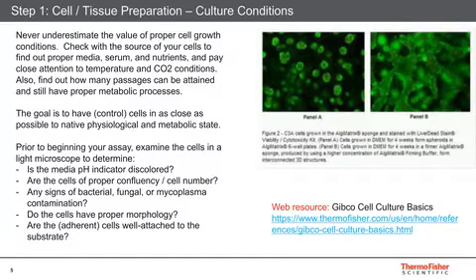And are the cells well adhered to the substrate, if you were talking about cultured cells? Or for tissue, like if tissue sections, make sure they're well adhered to the slide. If they're not, they can come off, and that can cause artifacts. Also consider the basis of your assay. Do you need cells in culture? Or maybe you want to go to what is increasingly popular, a three-dimensional model.